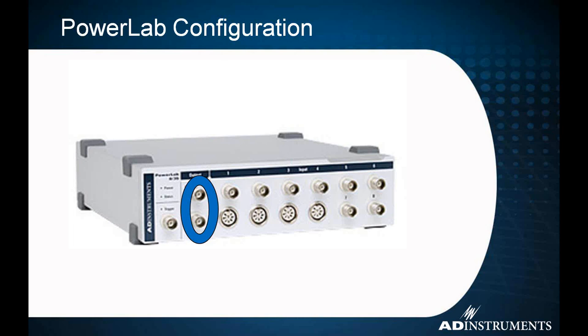What is a stimulator? What does it do? The stimulator is the name for the software interface that LabChart uses to control the analog outputs on the front of your PowerLab. Here we have one of our research series, the new 35 series that we just came out with not too long ago. On the left-hand side, you'll see the trigger input, and then you'll see output 1 and 2. These are the analog outputs, basically ways that LabChart can tell the PowerLab to send out a specific signal, and that signal will come out of these points as a constant voltage signal.